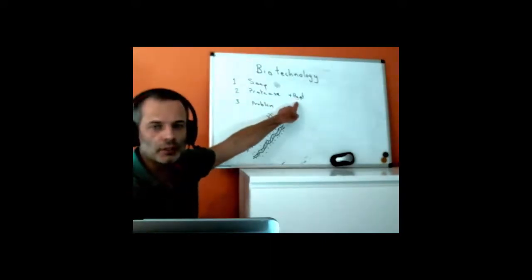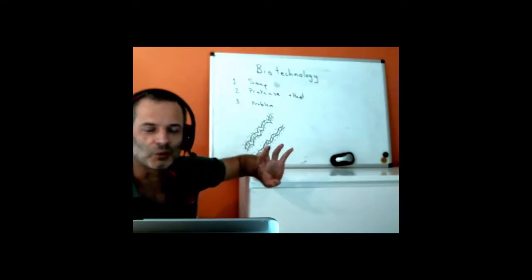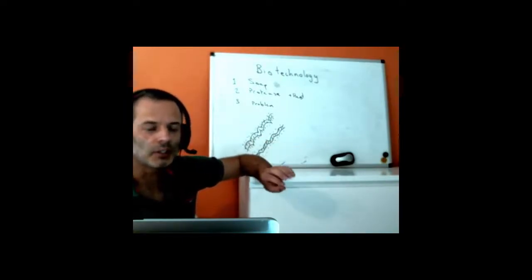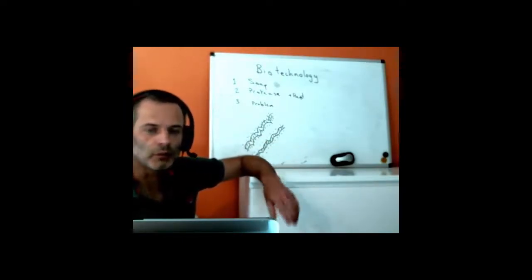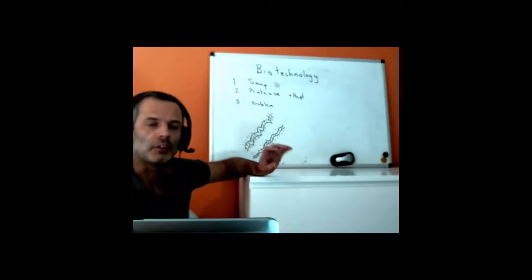In our case, we have to heat it up. Just to disclose where I'm getting it from, I'm getting a kit from a company called Biorad. It's a relatively big life sciences company, and they make educational kits which are very handy.